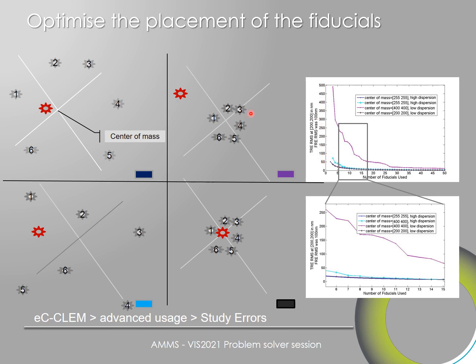avoidance of the center. If you take here a different situation where all the points of interest are extremely centered and the registration landmarks are centered and your point of interest is far apart, what you realize is that here the center of mass remains pretty much in the center of your points, but this guy here is far apart. And the consequence is that you might have a lower precision here because you're far away from your set of points. And that's what we see here in this purple curve, where basically we have a low dispersion of points. The center of mass is fairly strong, but it's quite far apart from the point of interest. And therefore, you will need to have a lot of points here in this narrow area to make high precision far apart from your sample, and you might even never reach the optimal situation.